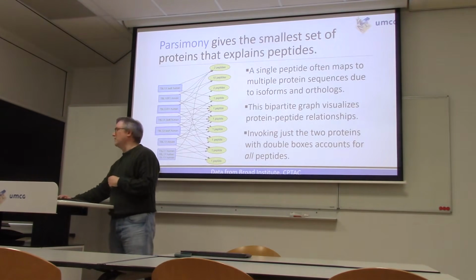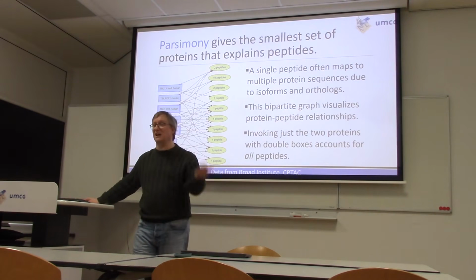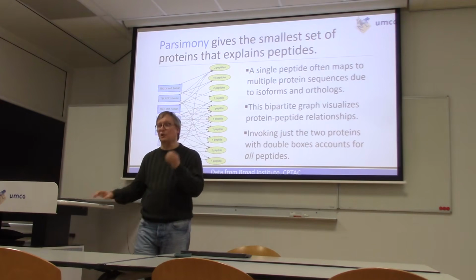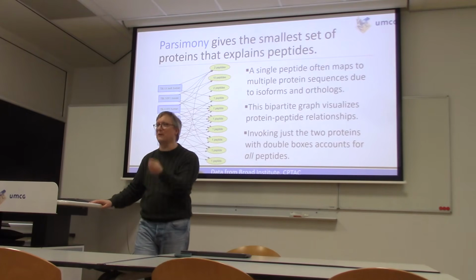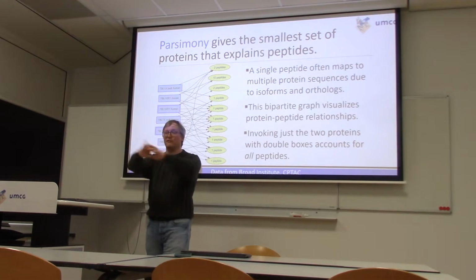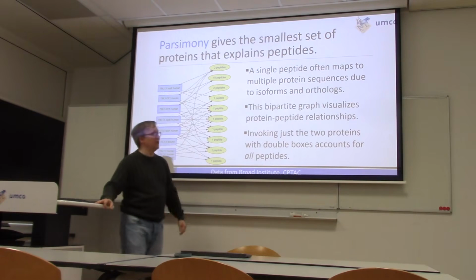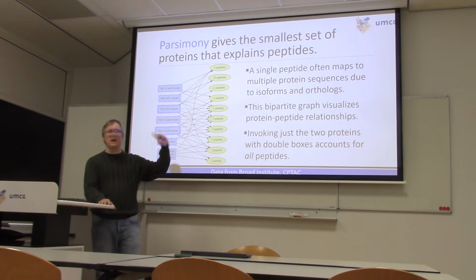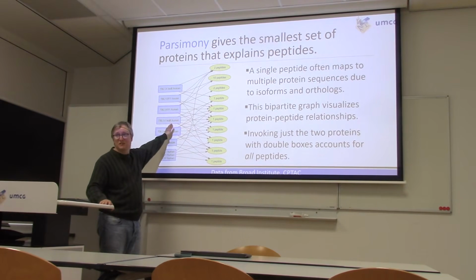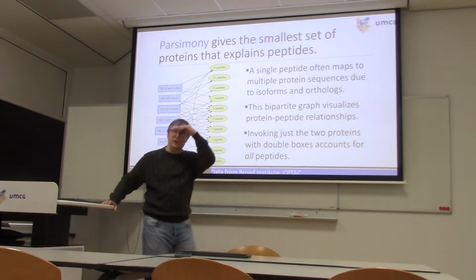The peptides are separated from each other over LC time, and unless you're looking at a particular gel plug that has all the protein kind of isolated by itself, if you're using LC, that information of the connectivity among the peptides is lost. So this is called a bipartite graph. It has objects of two types. It has proteins, these are hypotheses again about which proteins may be used to explain peptides, and the peptides are shown over here at the right.